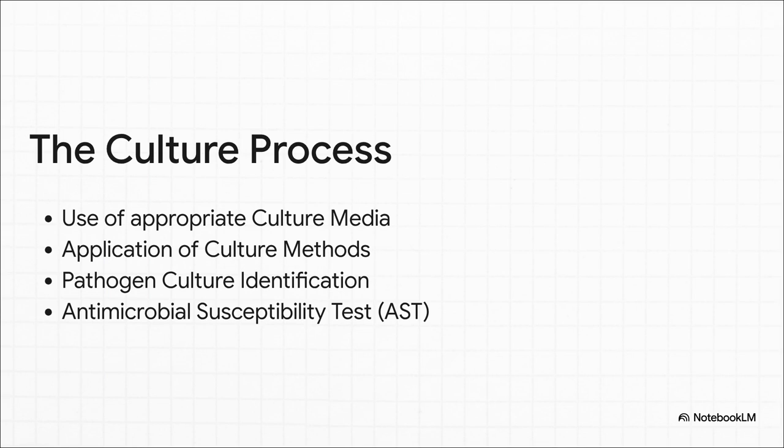Blood agar is our enriched, all-purpose plate. Most things will grow on it, and it's also differential, because we can see how the bacteria break down the blood cells. MacConkey agar is both selective and differential. Its bile salts stop gram-positives from growing, and it differentiates gram-negatives based on whether they can ferment lactose, turning the colony pink. Chocolate agar is even more enriched for super picky organisms like Haemophilus. And then there are highly selective media, like LJ medium, specifically designed for slow growers like Mycobacterium tuberculosis.